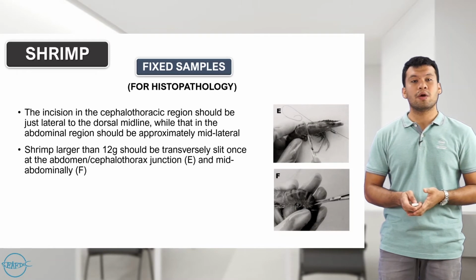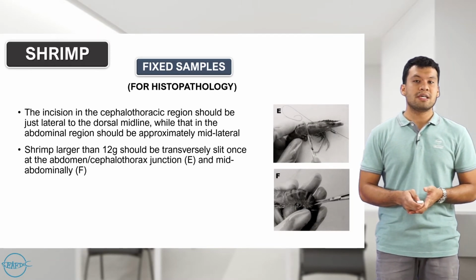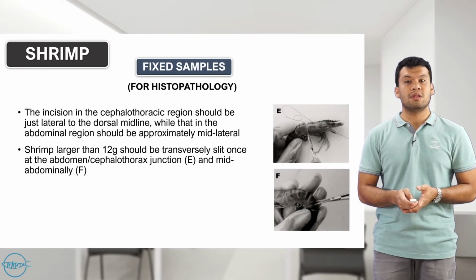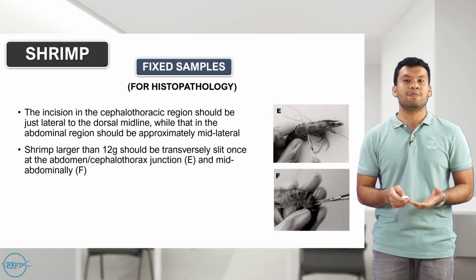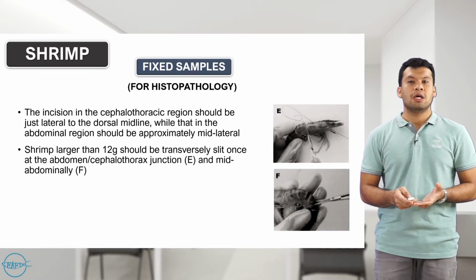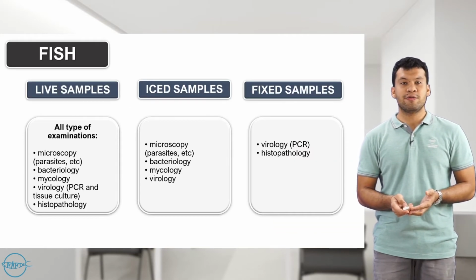As I said a while ago, for larger samples, you need to carefully fixate your sample and then at least inject some fixative within the bigger sample since the penetration of the fixative is very important. And then you can cut it and make some incisions so that you could carefully collect your sample upon fixation.